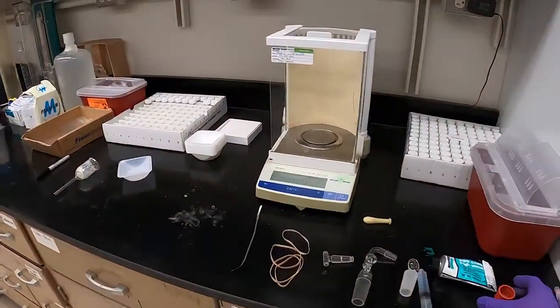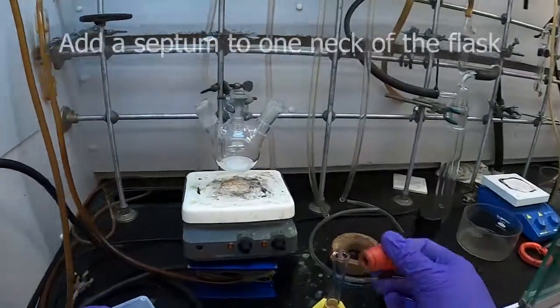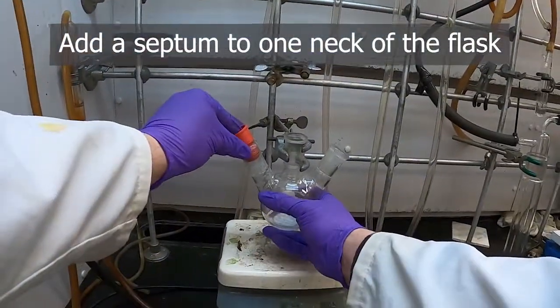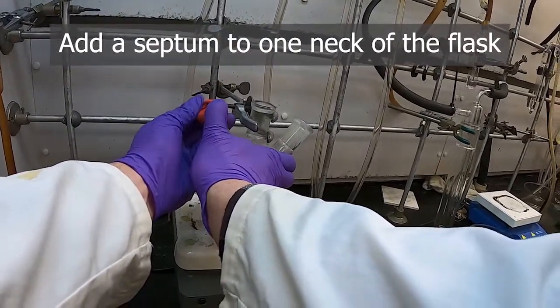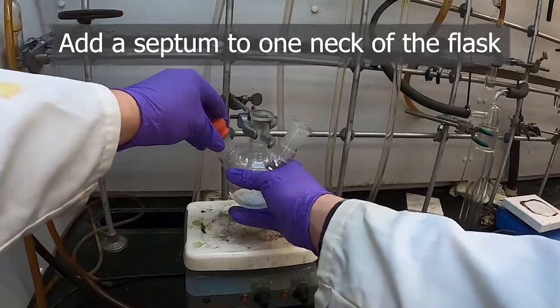So our next step is going to be adding a few things here. We're going to add a septum to this side, and you'll see why in a moment. These can be tricky sometimes, especially if they're new. Just hold the lip over.